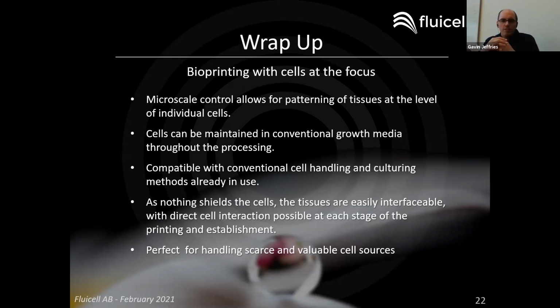But this also aids in the next point, which is that nothing is really shielding the cells. These tissues are interfaceable directly. So you can interact with the cells, or you can change their microenvironment, as we showed early on with the HCF demonstration. You can deliver compounds directly to the parts of the tissues that you're most interested in. Because this is at its core a microfluidic technology, it has a huge advantage in that it's perfect for handling scarce and valuable cell sources, as the volumes consumed are typically in the few microliters.